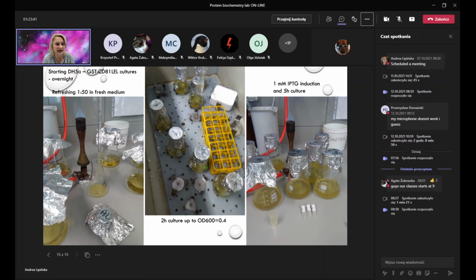So this is what you will use, and you will check the soluble fraction, so the lysate of the bacteria, and also the leftovers of the membranes and inclusion bodies. Usually if we have the protein in the insoluble material, this will be inclusion bodies, not membranes, but just inclusion bodies. And I think the only really soluble GST fusion protein that I saw was just pure GST protein. And this one is not that bad. And for some of them, you just get insoluble proteins still, even if this is GST.